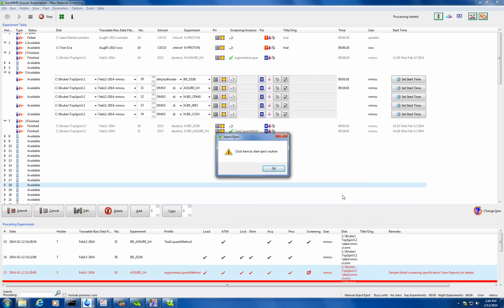So we have no database, so till now we cannot deal with the data we got. We can quantify individual compounds and look for differences between one sample and the next, but we won't be able to identify everything. Tonight I'll search through and see if I can find it. I can log into my spectrometer in Boston and see if I can find any of your data. If there are spectra, that could give you a head start. I think Sarah already started it. That would be good.